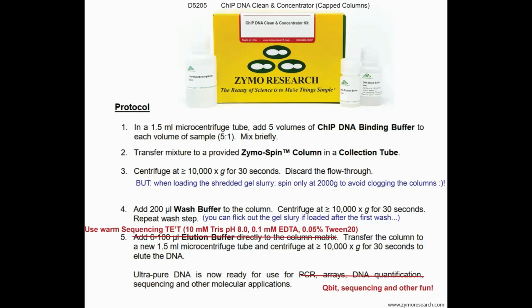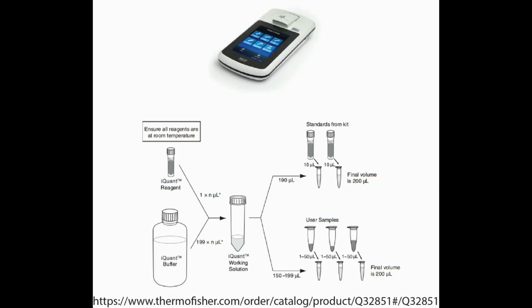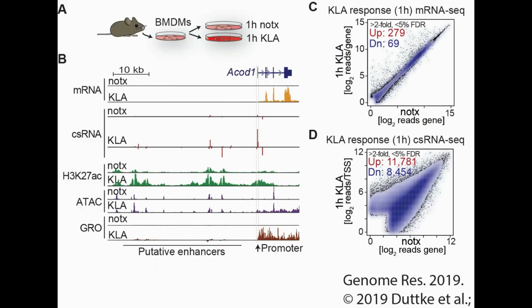However, I would recommend to elute using sequencing TE and not the provided elution buffer. I commonly elute csRNA-seq samples in 20 microliters and input samples in 60 microliters of sequencing TE. For quantification, I would recommend using the high sensitivity DNA kit.